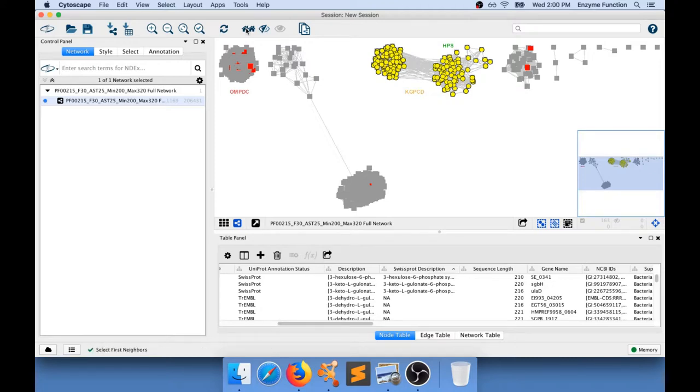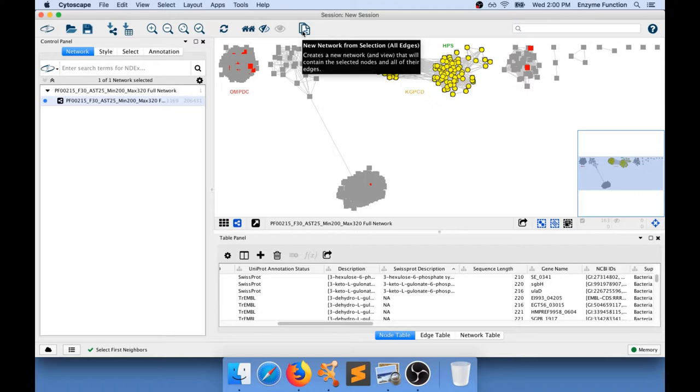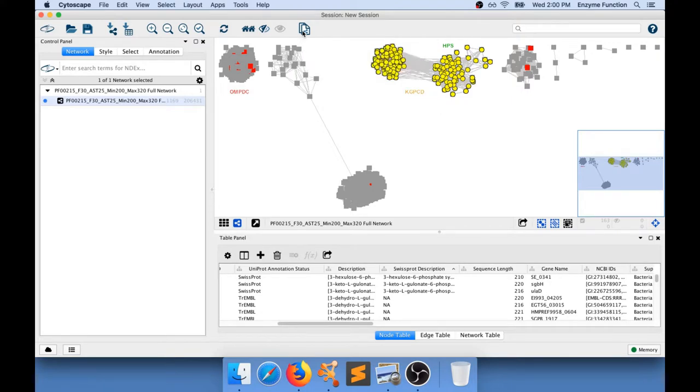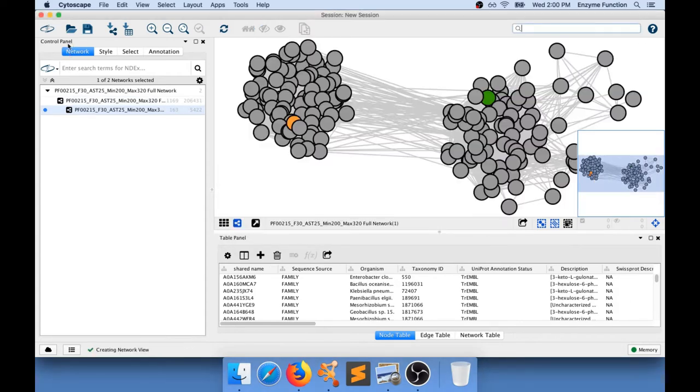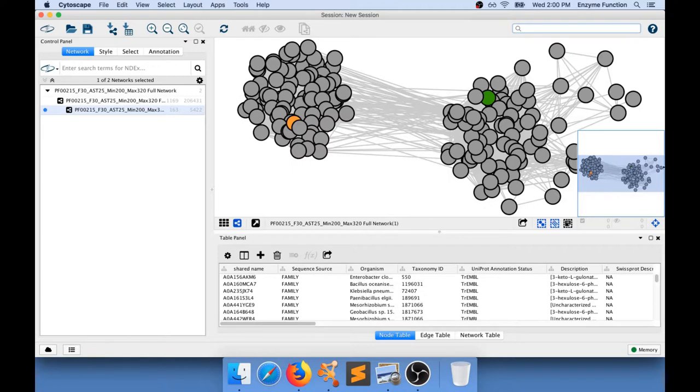What you can also do is generate a daughter network from selected nodes and edges. If you do that you will see in your network control panel in here you have a sub-network that appear from the first one that only show what you were working with.